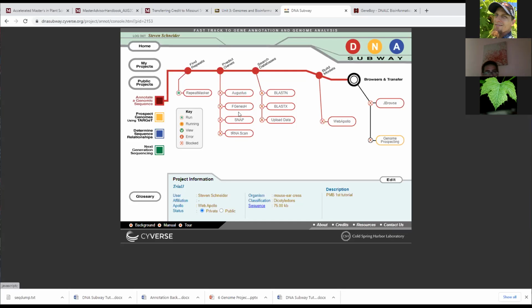And then you'll compare your gene to see if it has any homologs. And so we can get to the possible function of that sequence, the protein that it codes for. You can do a BLAST-N search for nucleotide or BLAST-X, which is probably what we'll do, and so forth. The tutorial we're going to do will take you through that.